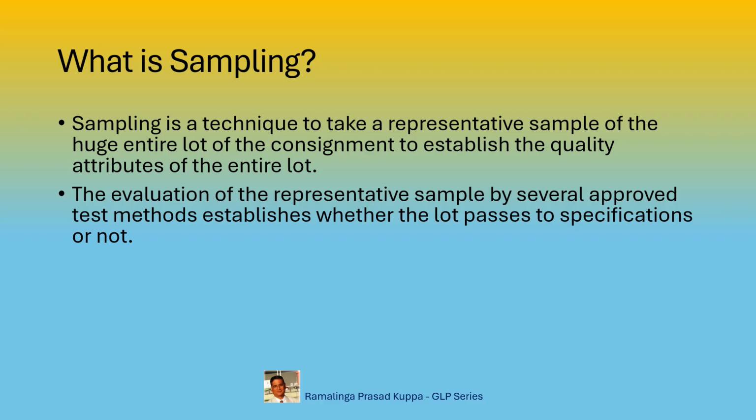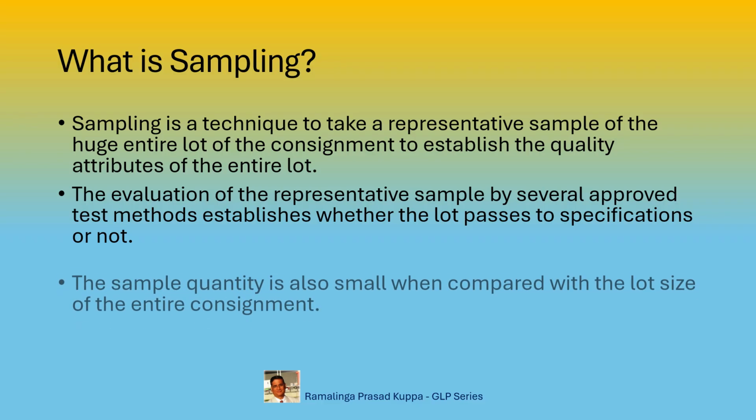The sample thus collected will be evaluated against a set of approved specifications with several analytical techniques to establish the quality attributes and decide whether the product passes or fails to specifications.